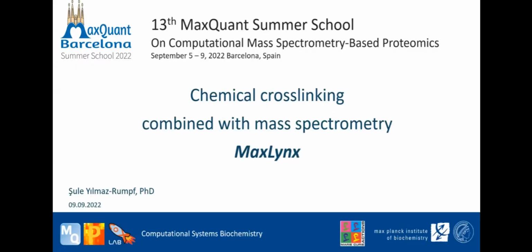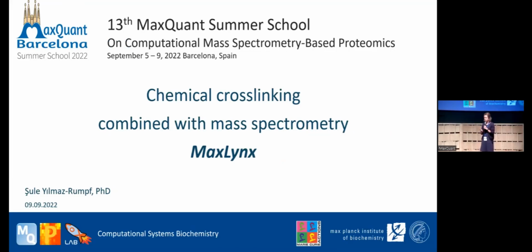So hi everyone. Now we are going to talk about the chemical crosslinking combined with mass spectrometry with the new algorithm in MaxQuant and MaxLynx. So I'm happy to say that it was part of my Marie Curie individual fellowship postdoc, which I finished last year, last December. And this paper was published in January.